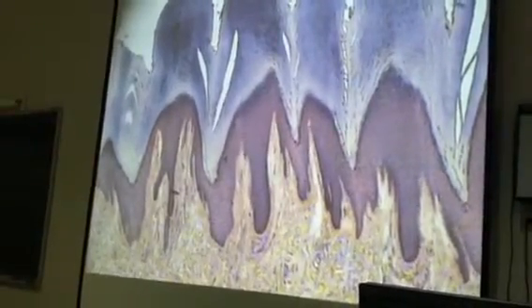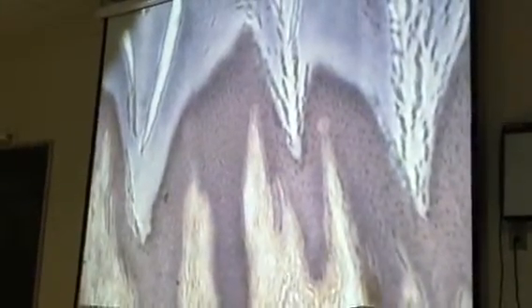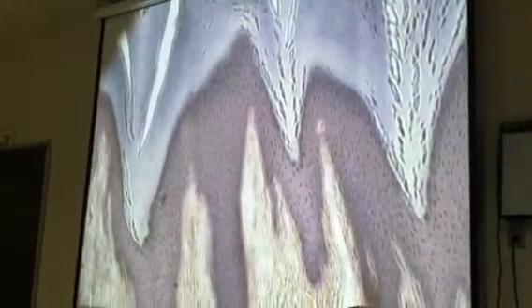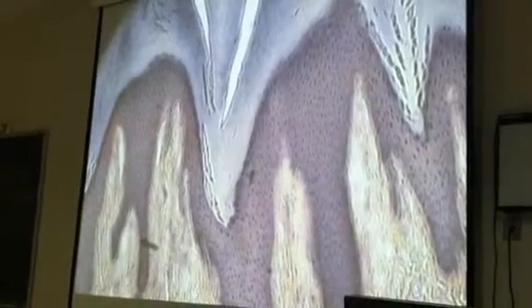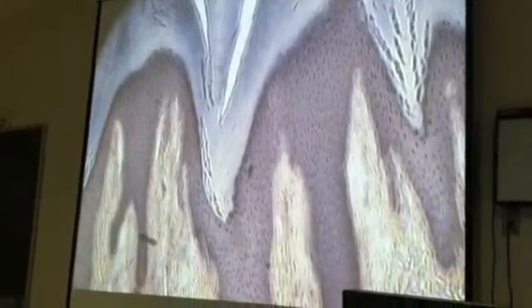Okay. And let's just move up magnification. Let me know if you have any questions. Okay, that's pretty good. Starting to maybe see a little bit of that squamous shape. And let's try one more.